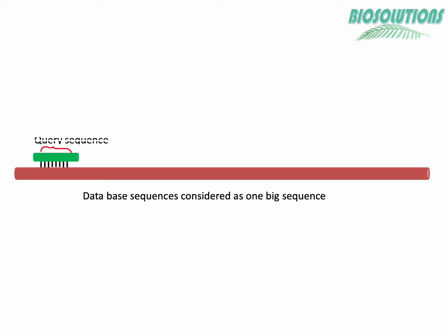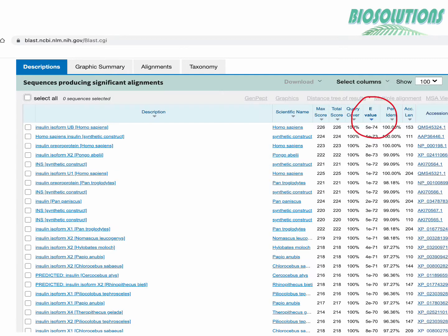Let me tell you the max scores come from the biggest alignment and the total scores are addition of max scores with any other smaller but significant alignment between the same pair of sequences as you can see here in this animation.